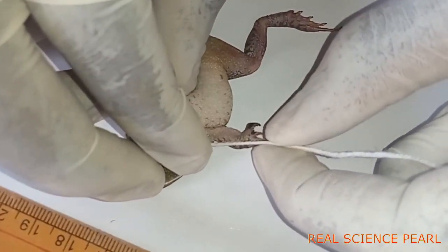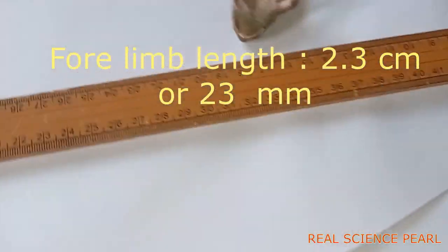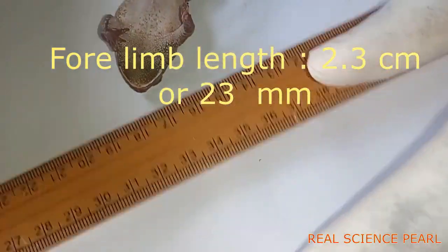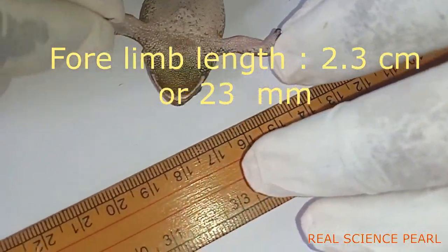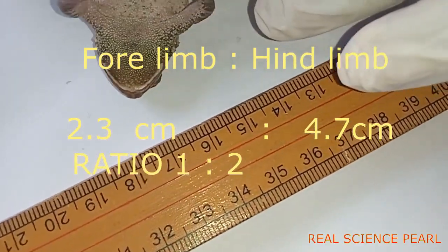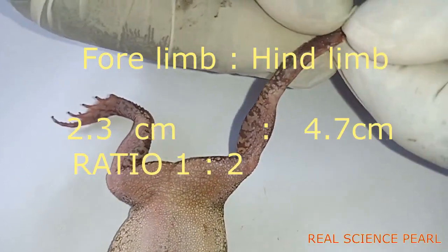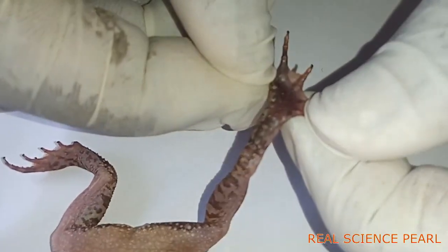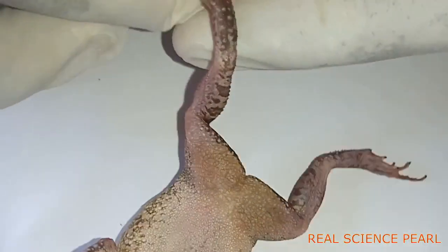The fore limb measures 2.3 centimeters. Getting the ratio, it is approximately one to two. The significance of the ratio is that it enables the hind limb to generate sufficient propulsive force for leaping or swimming in water, while the fore limb enables the specimen to absorb shock on landing.